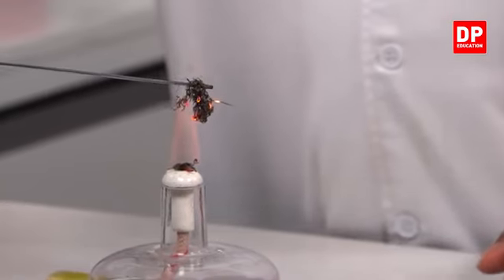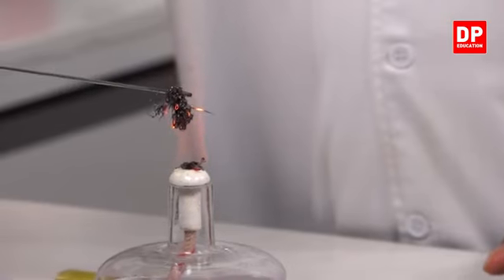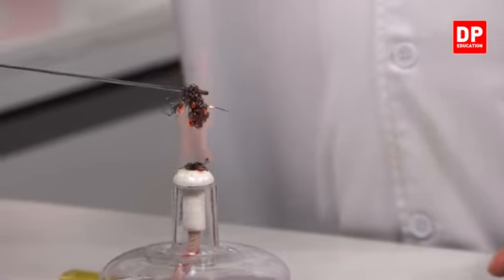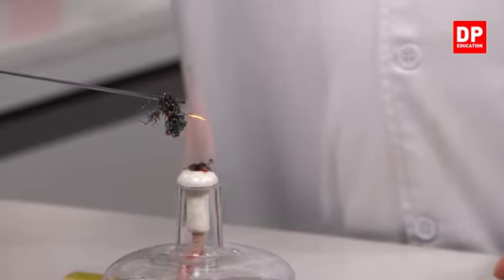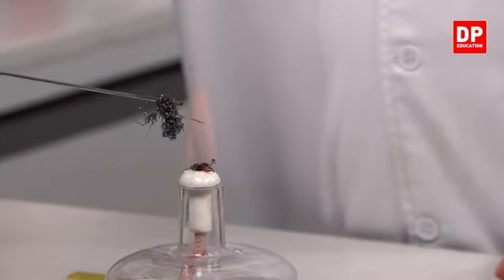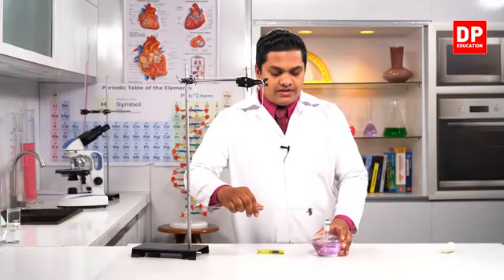So here you can observe the iron wool is going to give out a red color, and it's getting burned with a red color. Right, now let's see what has happened to the balance of the system.